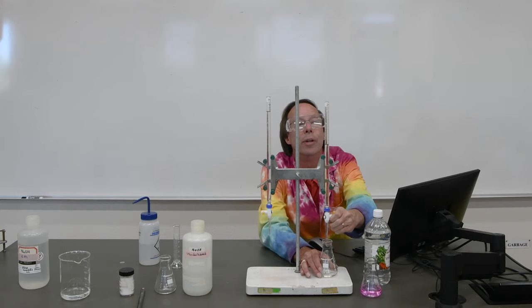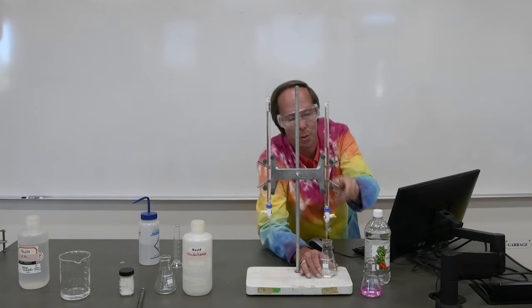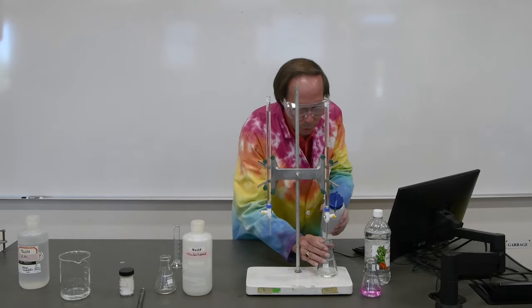8, 9, well, we'll slow it down a little bit. Just creep up on the 10. And there we go. And of course, we'll shoot that one little drop in there.